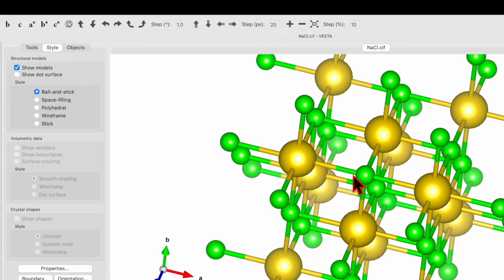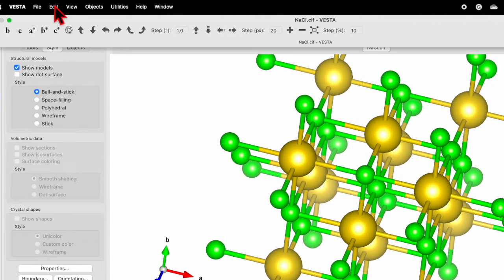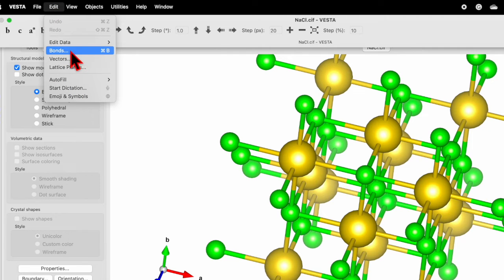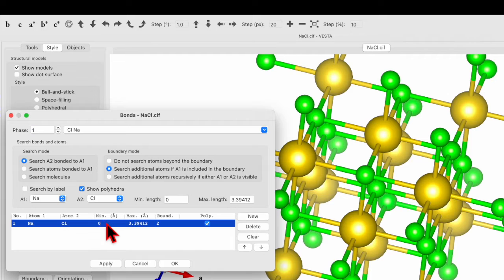Now we can see a unit cell of sodium chloride. Here I don't want to see the bond and this extra atom, so how to remove them? Just go to Edit, and then over here you will find the option for the bond. So click over here.